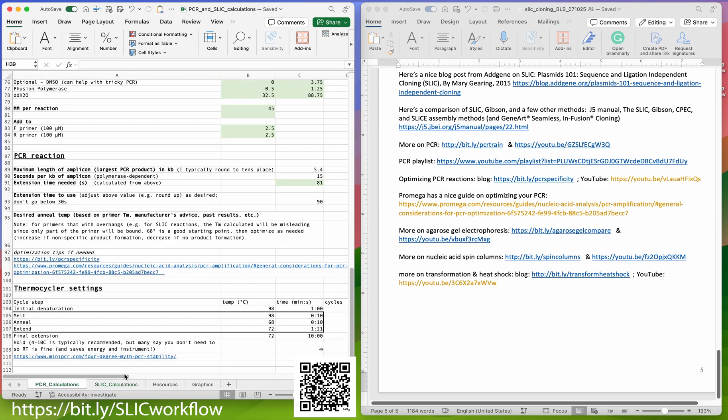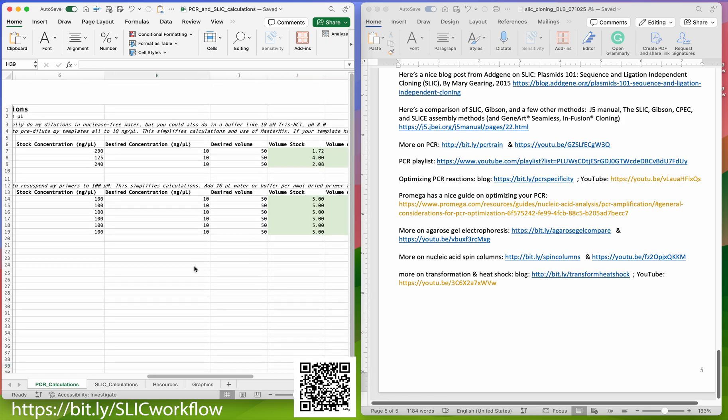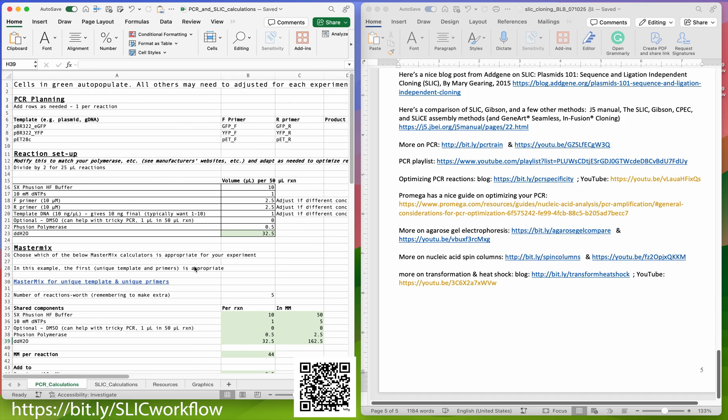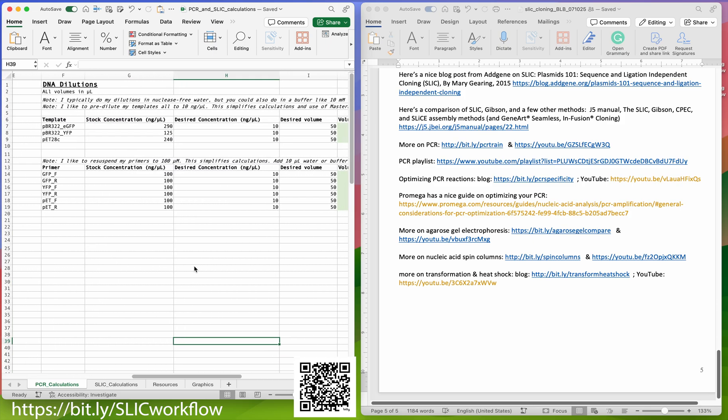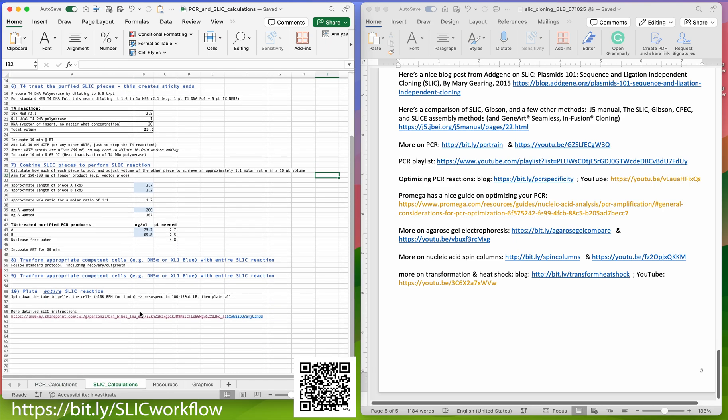I made a spreadsheet that goes through those various things. The first page, the PCR calculation page, can be used even if you're not doing SLIC. The SLIC is then the second tab, and you can use PCR to make the products that you use for the SLIC, but you can also do PCR without doing SLIC.